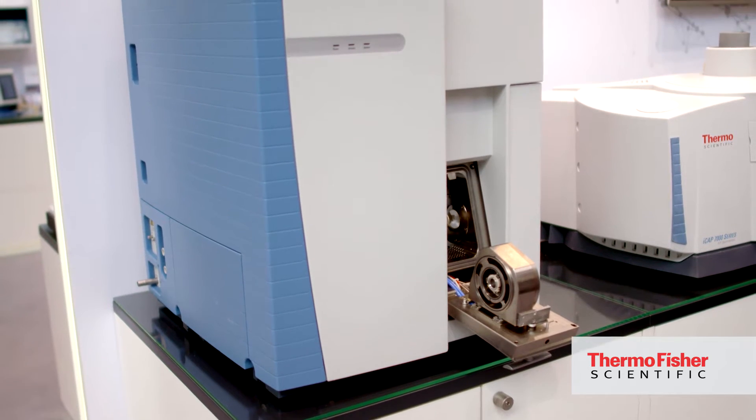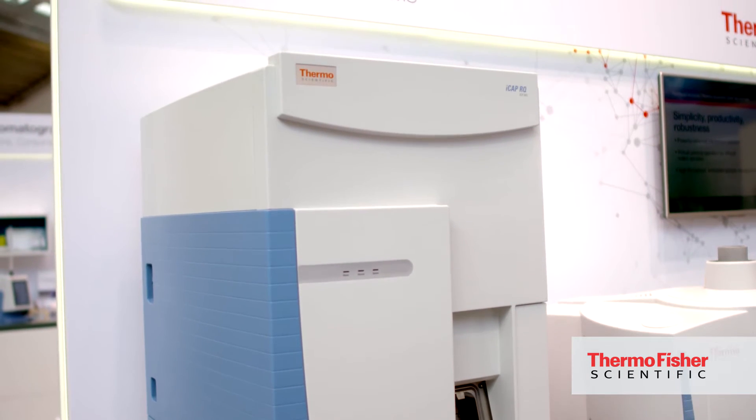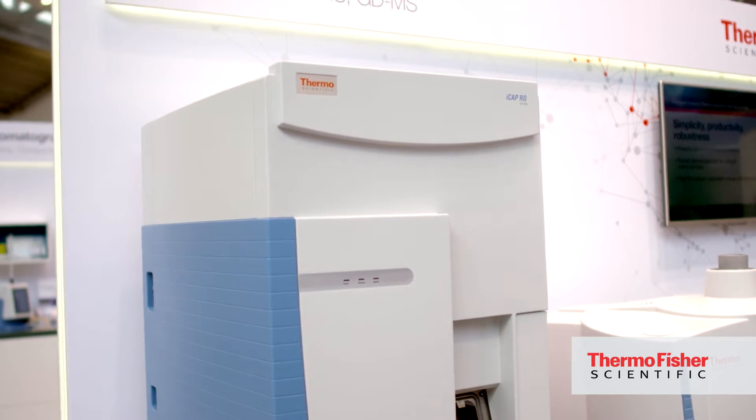This is the new ICP-MS from Thermo Fisher Scientific. It's called the ICAP-RQ, and the R stands for Reliability or Robustness. Its major development from the predecessor, the ICAP-Q, is that it's more reliable, more robust, and can stand more total dissolved solids. It can take higher concentrations for a longer time without any drift, so the results we obtain are more reliable.